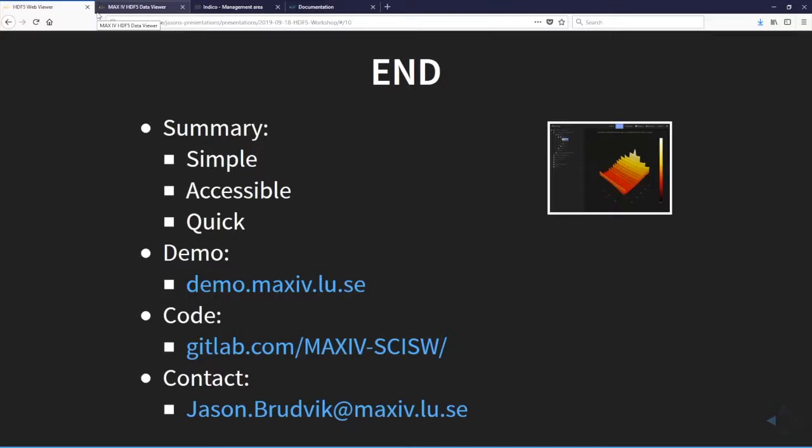And the third aspect is some Qt widgets that were initially inherited from PyMCA and then expanded, for browsing HDF5 files and visualizing data. We'll come back to that.